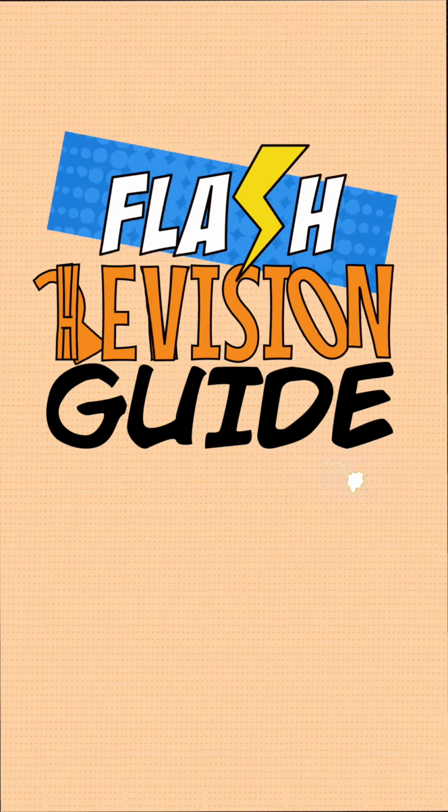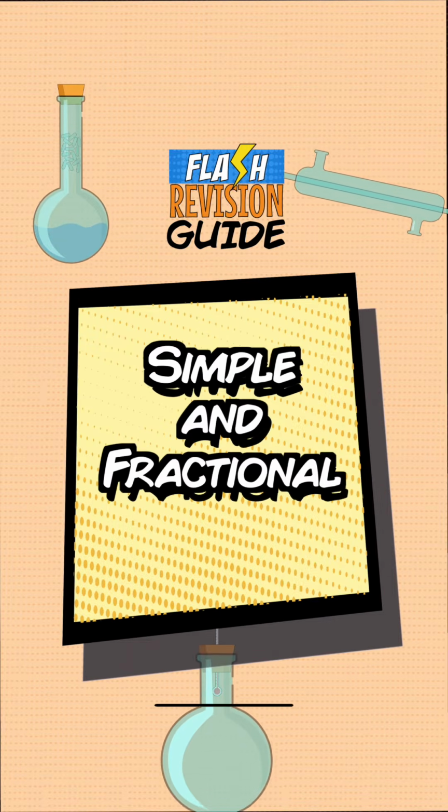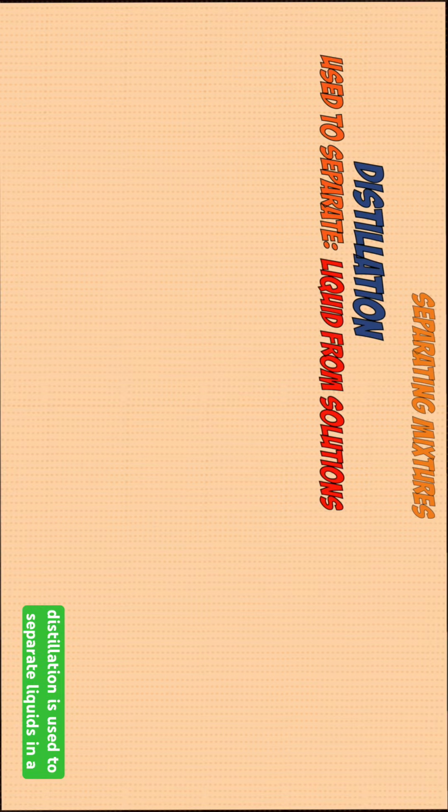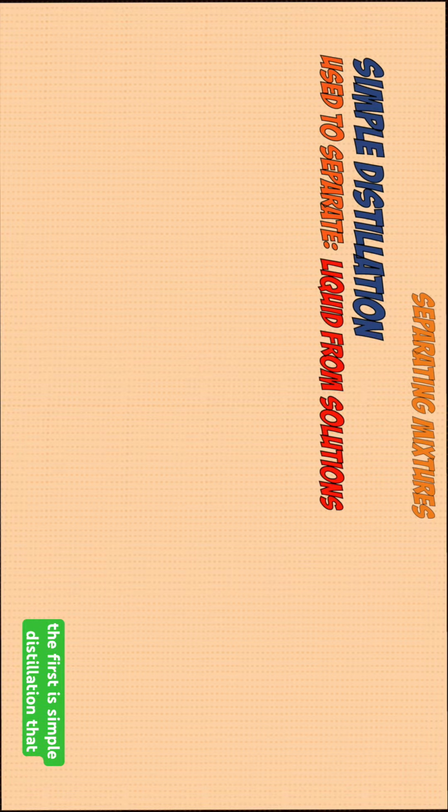Here's a flash revision guide on simple and fractional distillation. Distillation is used to separate liquids in a solution or liquids with different boiling points, and there are two types. The first is simple distillation that can be used for mixtures of two different liquids.